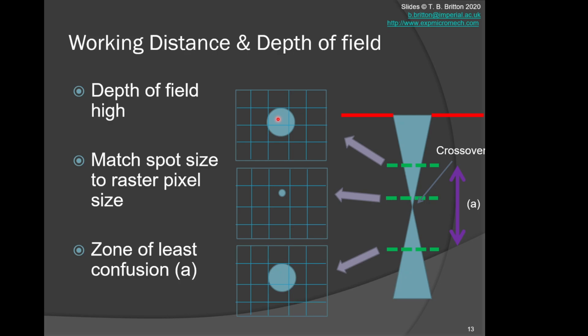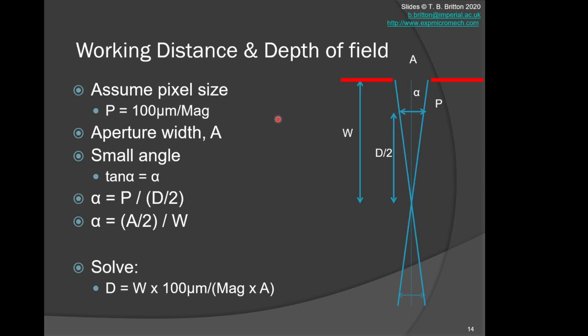Now, hopefully, you can see this is a relatively simple piece of geometry where you have the opening aperture size that effectively determines, together with the point where crossover happens. You can see there are a pair of similar triangles with the opening angle alpha that will control effectively what the effective working distance is for an appropriate size of feature over here.